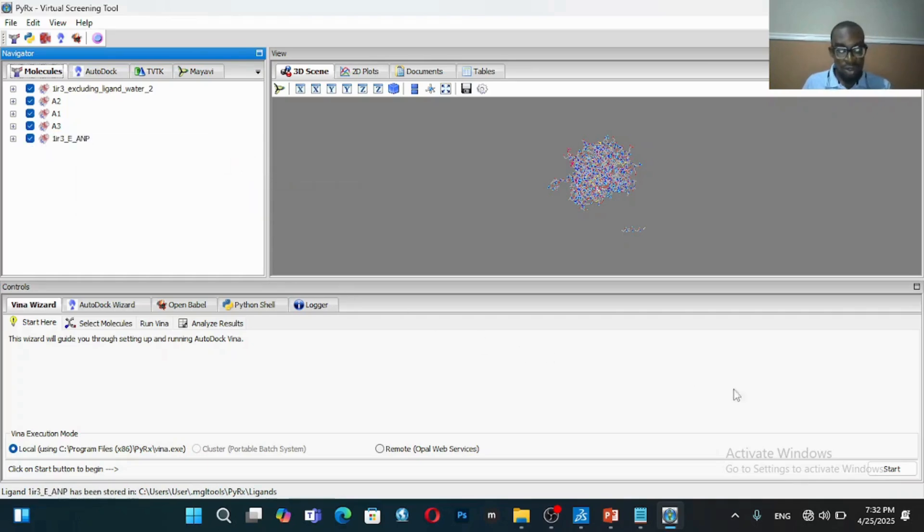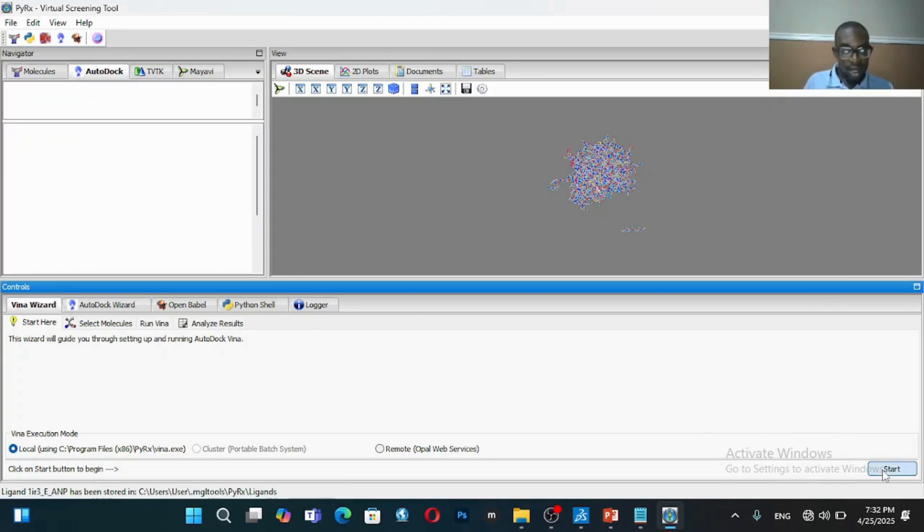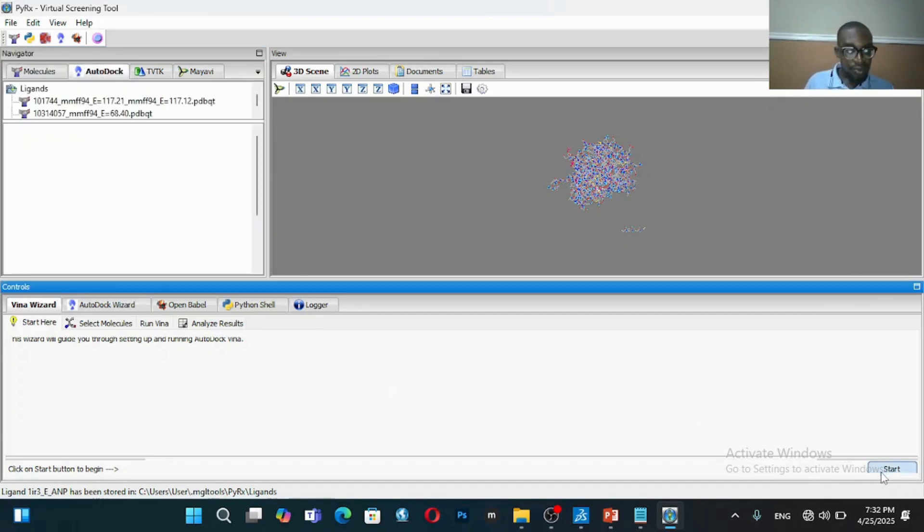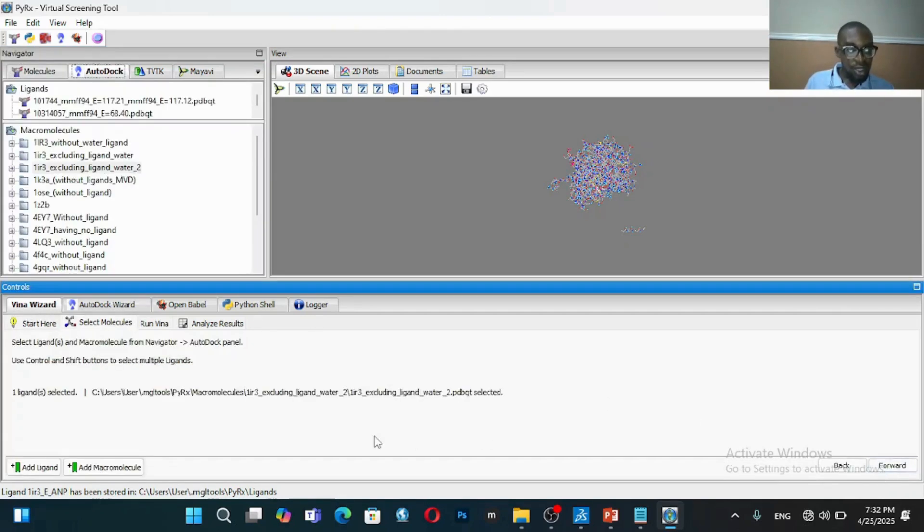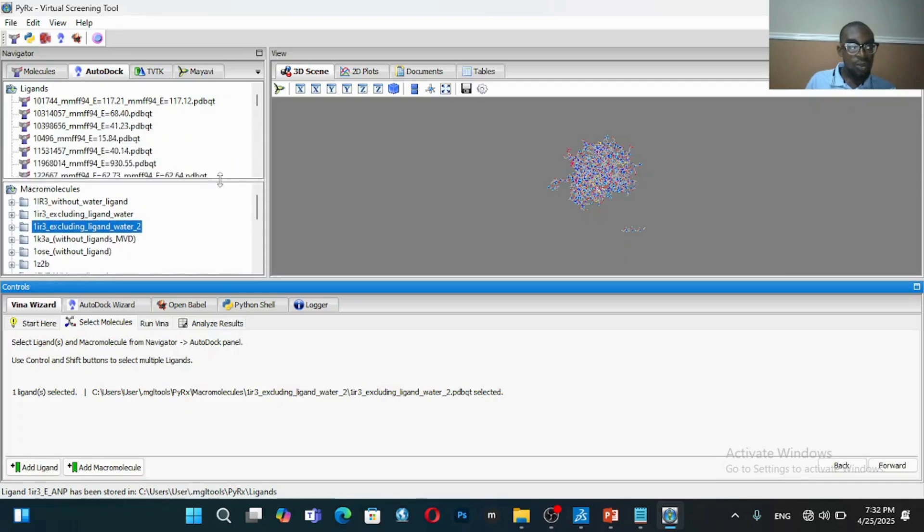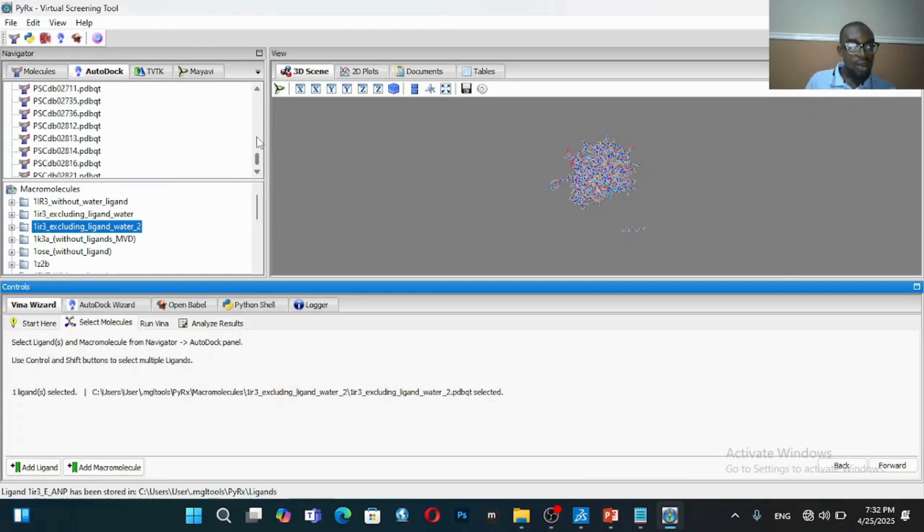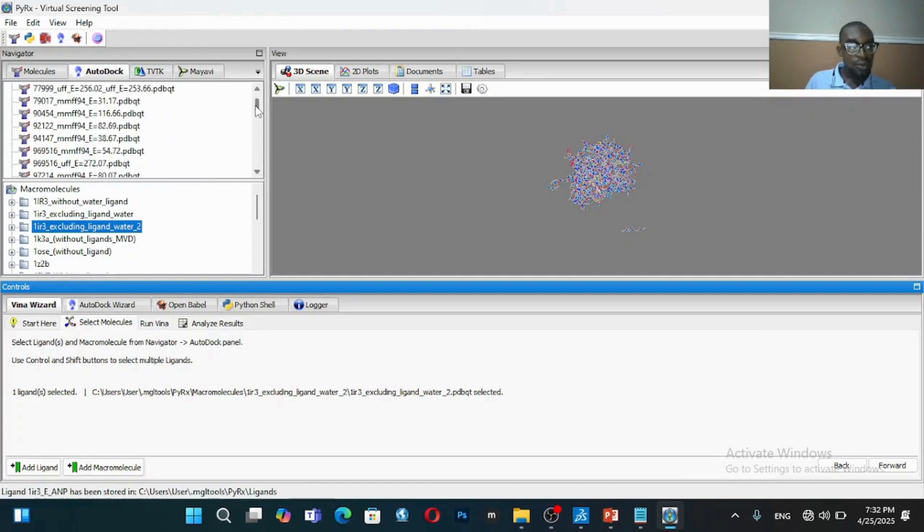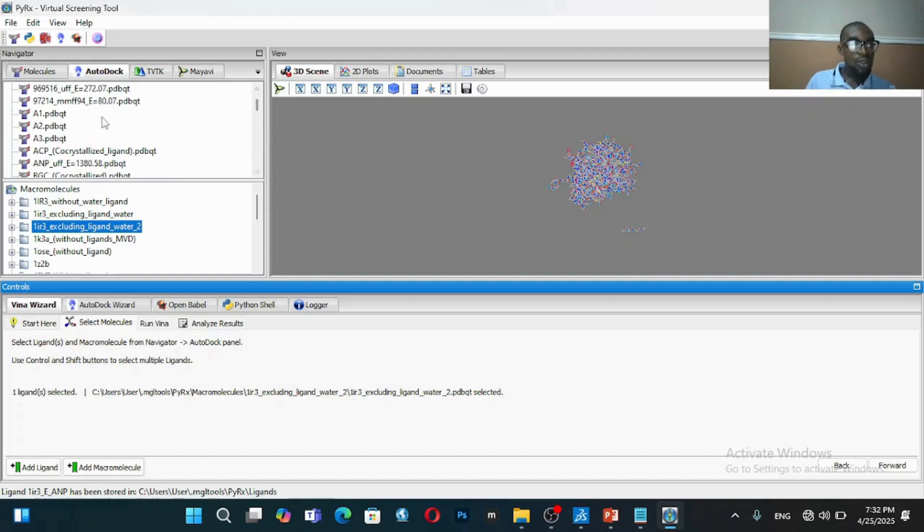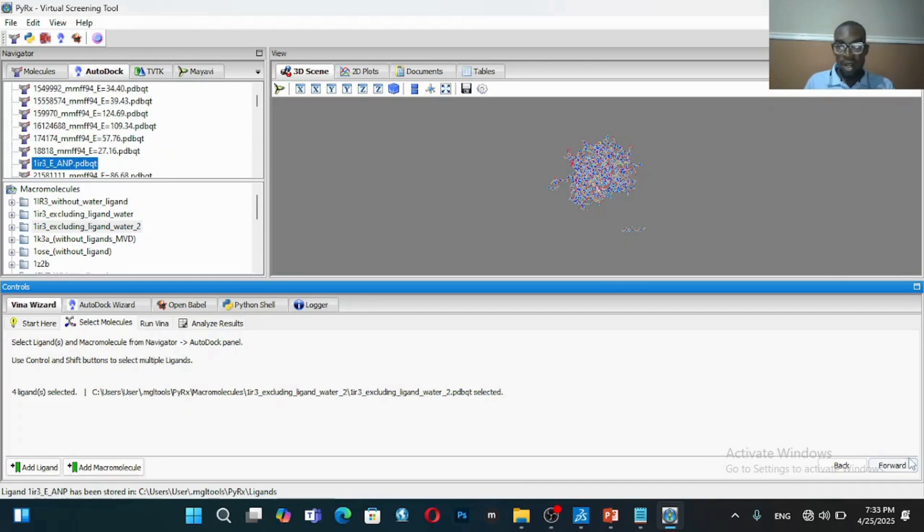Go to Vina, click on Vina, and then click on Start. It has selected the macromolecule. You can see it's selected. And then it has selected one ligand. I want to select the other three ligands, so I'll look for them: A1, A2, A3. What I will do is I'll click on Forward.